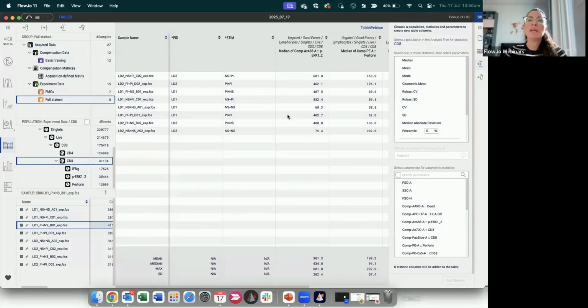But sometimes we may have some samples that have really low values or really high values, and in that case, if we do use the mean, for example, we risk having a value which is too sensitive to the outliers, so to the values that are really, really low or really, really high, while the median sits in the middle of the distribution of the data. So there's less risk of being influenced by outliers. I hope this answer is helping you.